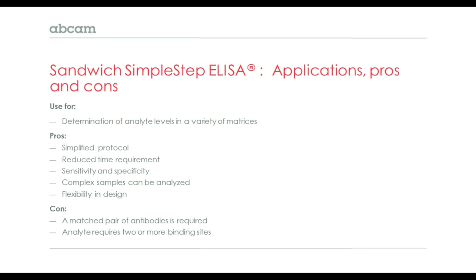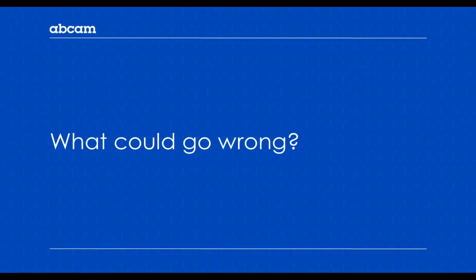The pros and cons are really very much the same as they are for the sandwich ELISA itself, being a variant of it. And particularly nice for researchers is the fact that you can run one of these in a morning and have your data to look at, and perhaps talk to us about in scientific support at Abcam, or be able to display in a presentation later that day.